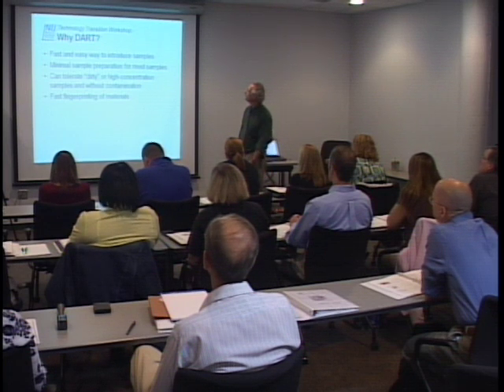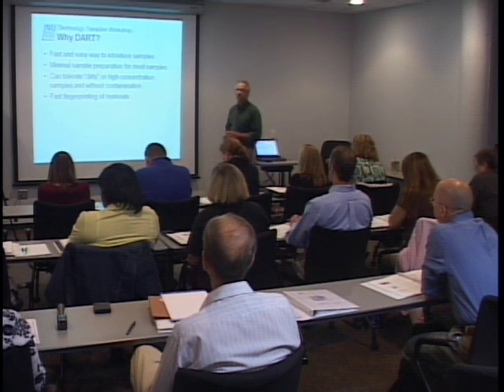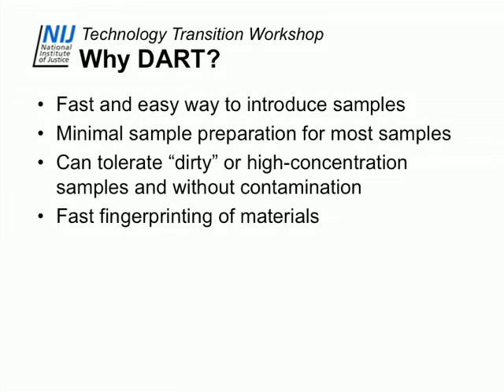Okay, why bother to worry about things like DART? Well, it really is fast and easy. It's the most fun I've had since I started doing mass spec years ago. We came close back in the 80s when we got laser desorption working on a Fourier transform mass spec, and we started putting everything we could find into that. But this is even better because you don't have to put samples in a vacuum.